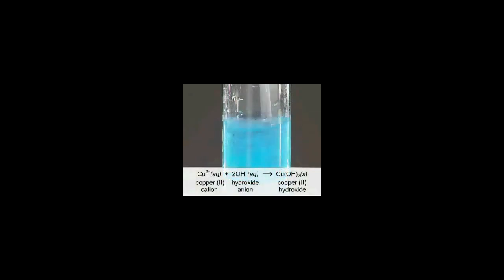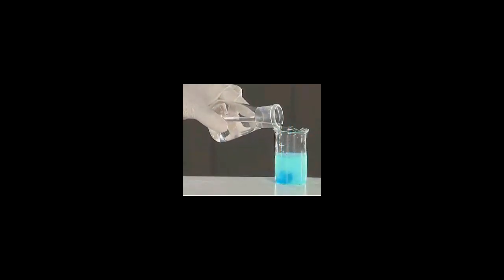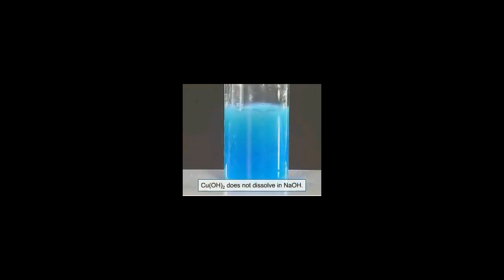Copper ions react with sodium hydroxide to form a blue precipitate of copper(II) hydroxide. This precipitate does not dissolve in excess sodium hydroxide solution.